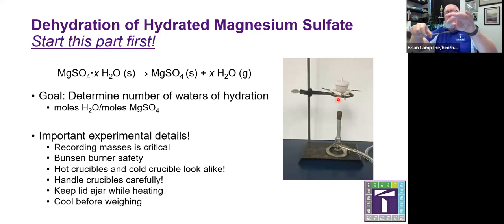And if you happen to squeeze the crucible tongs too tightly, you can cause the crucible to fall off, and then you at best lose your material, at worst break the crucible. So I've always found it's better to err on the side of caution and just carry the crucible with your tongs like so, so that you've got a reasonable grip.